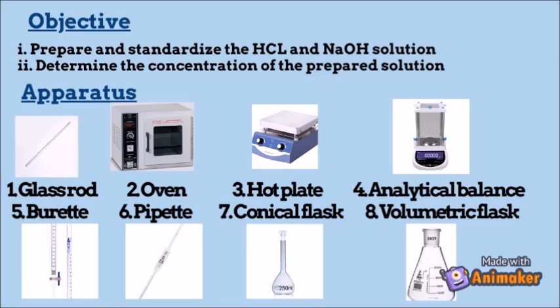The objectives are, first, to prepare and standardize the HCl and NaOH solution. Second is to determine the concentration of the prepared solution.